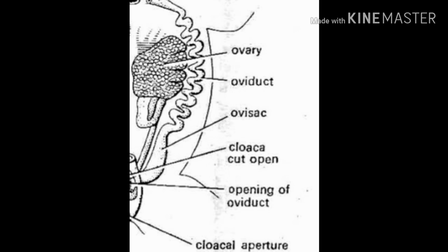As for the ovaries, which are the dark organs attached to the ventral surface of the kidney, they are the ones that make eggs. The oviducts are paired white coiled tubes lying lateral to the kidneys. It is where eggs travel through.